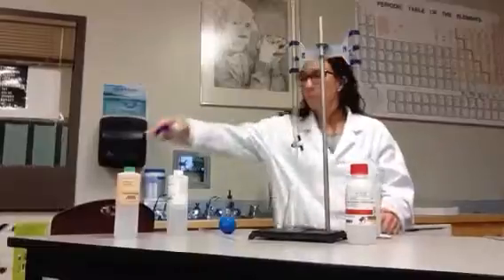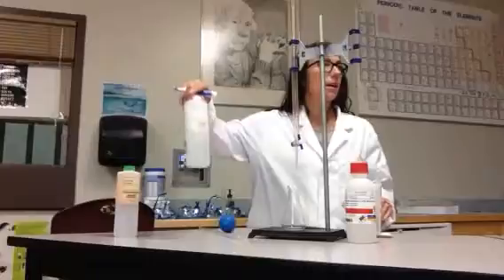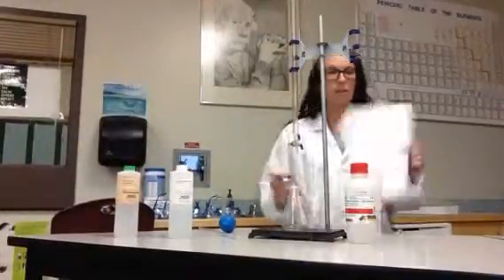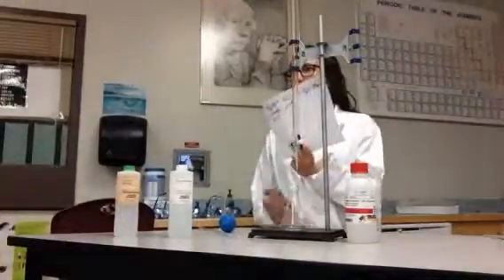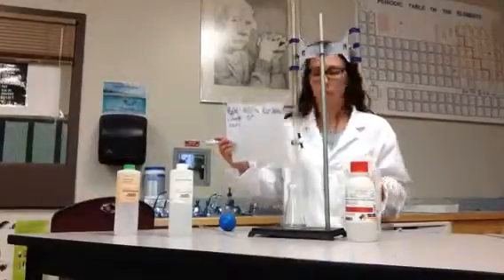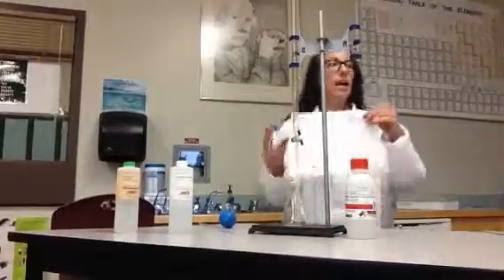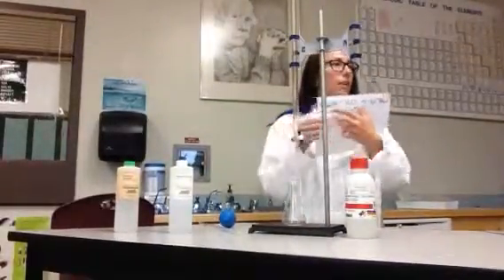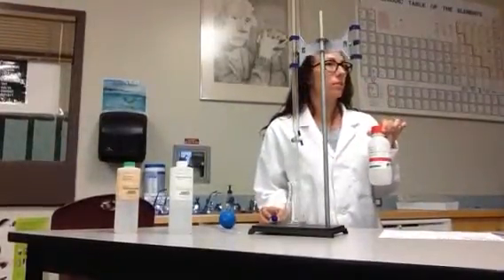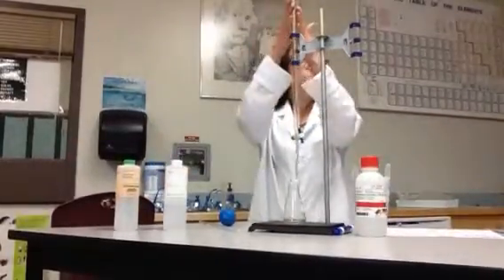Okay, so I know this bottle says this. Because I made this up myself, I'd like to know what the exact concentration is of that HCl. Do you see how this is already kind of looking like a solution stoichiometry? So I'm going to do a titration, and it'll tell me when I have reacted an exact ratio of 1 to 1 mole, because I'm going to add some indicator to this. Everybody get that?